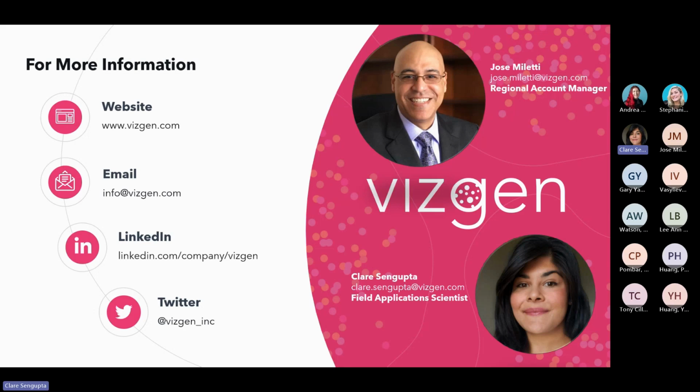So I mentioned our FFPE human data set. In addition to that, we also have a mouse brain data set and mouse liver data set. All of these are fully explorable on a web-based visualizer, which is on each of these releases' web pages, and you're able to download the data as well to explore it on your own.